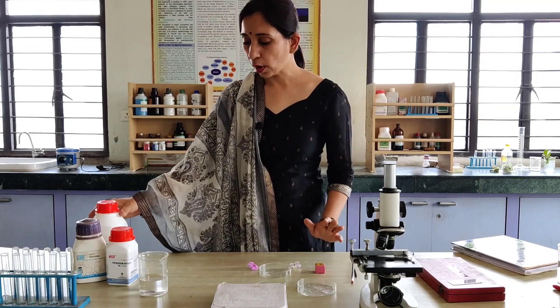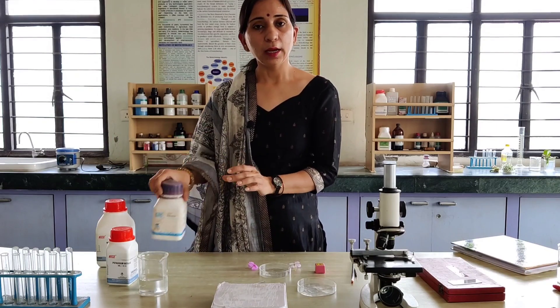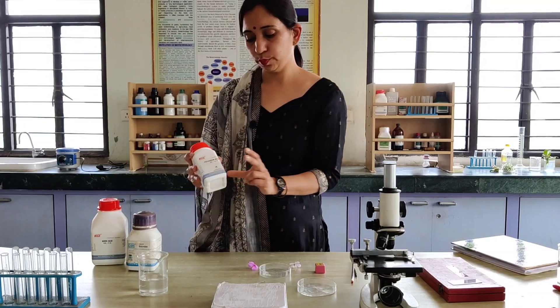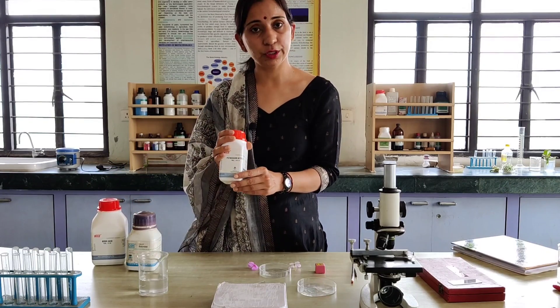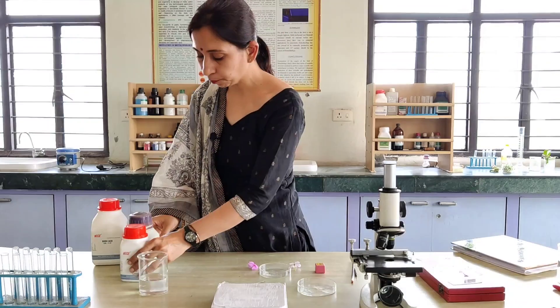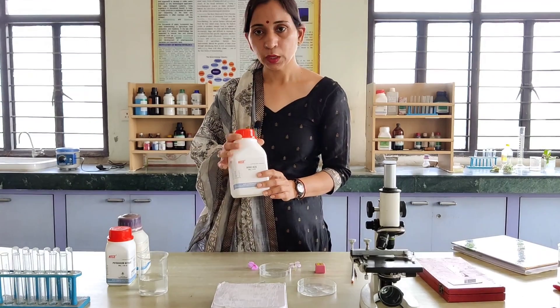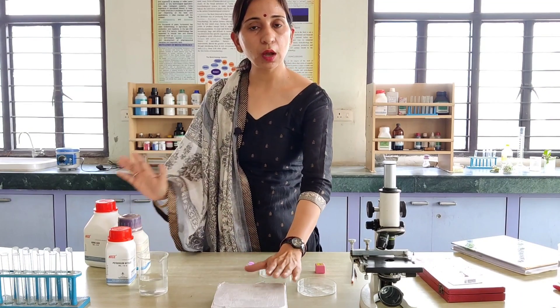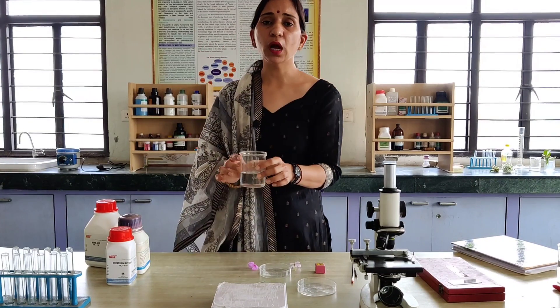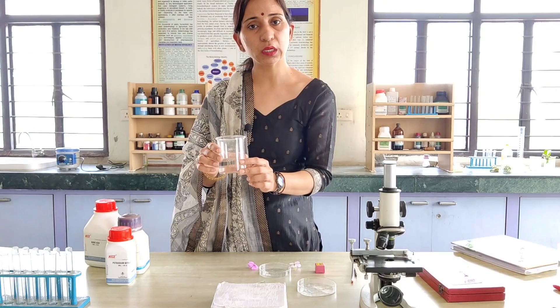For this nutrient media we require 10 grams of sucrose, 0.02 grams of potassium nitrate, and 0.01 grams of boric acid. We will put all these ingredients into 100 ml of distilled water, mix, and prepare a solution.